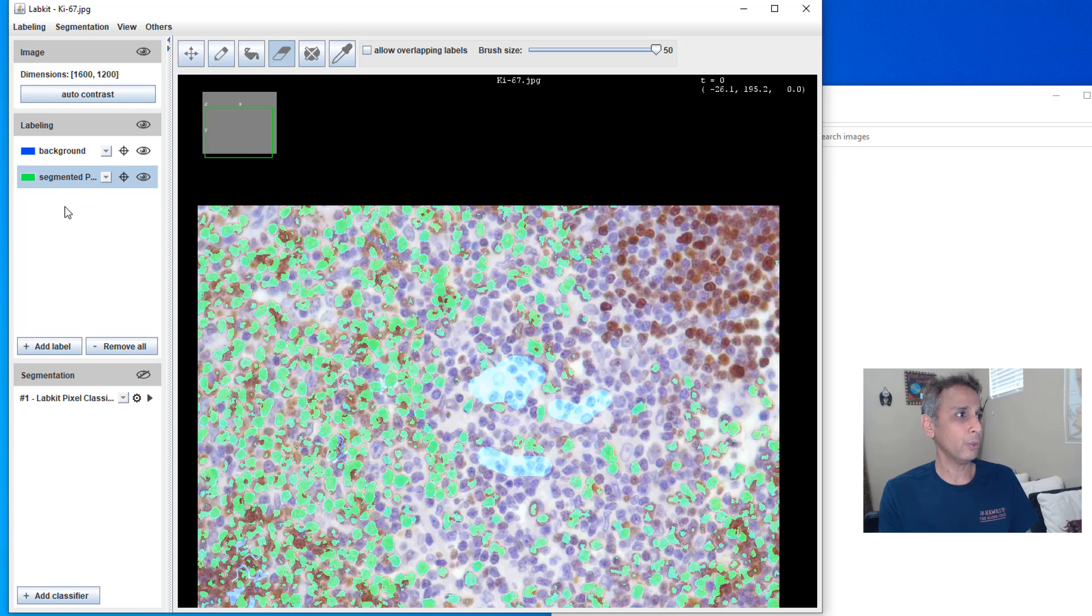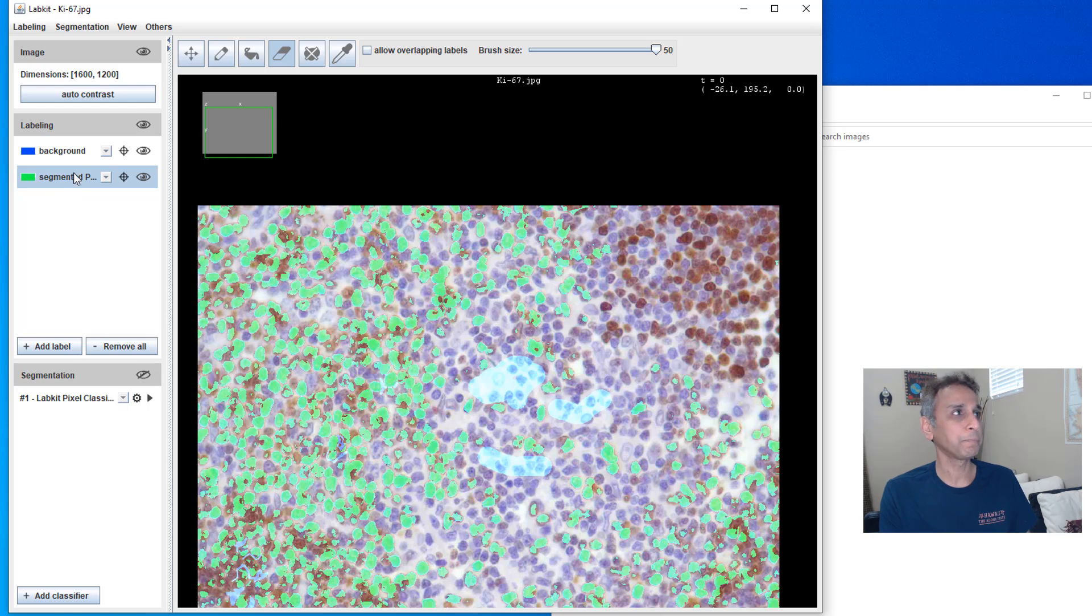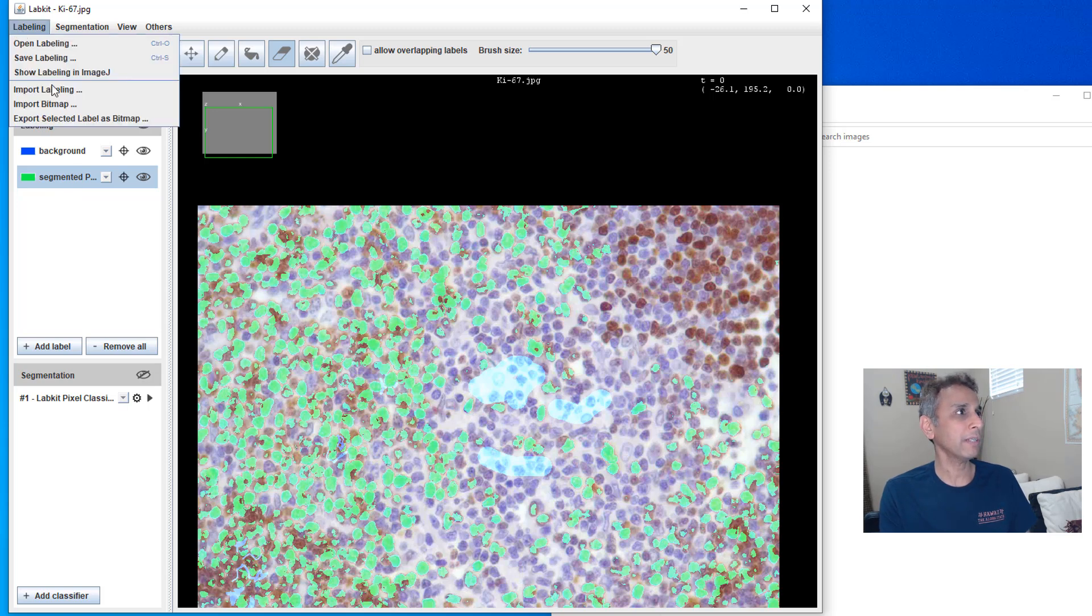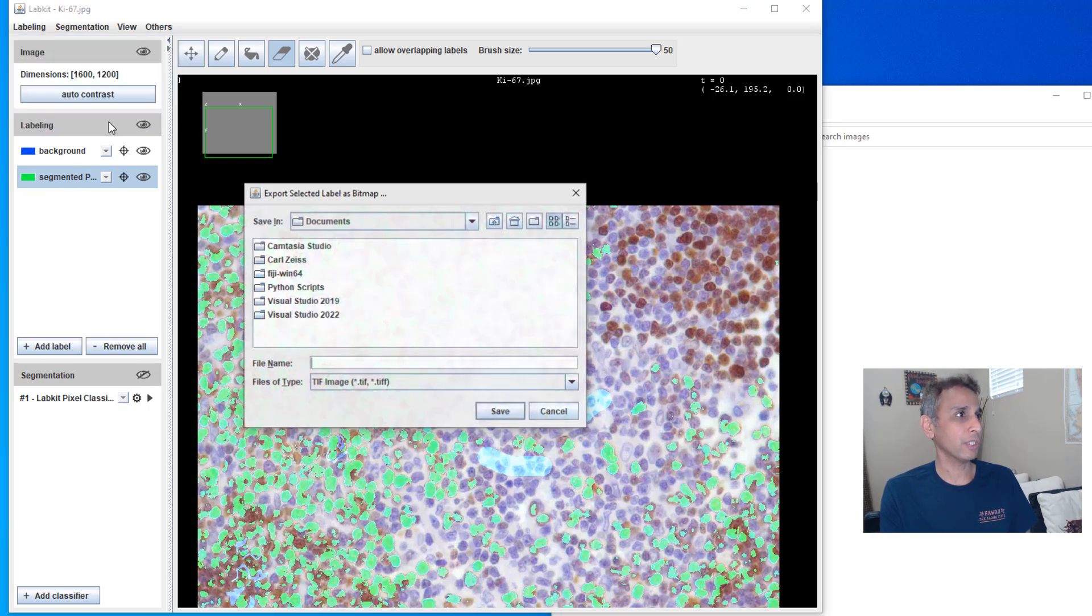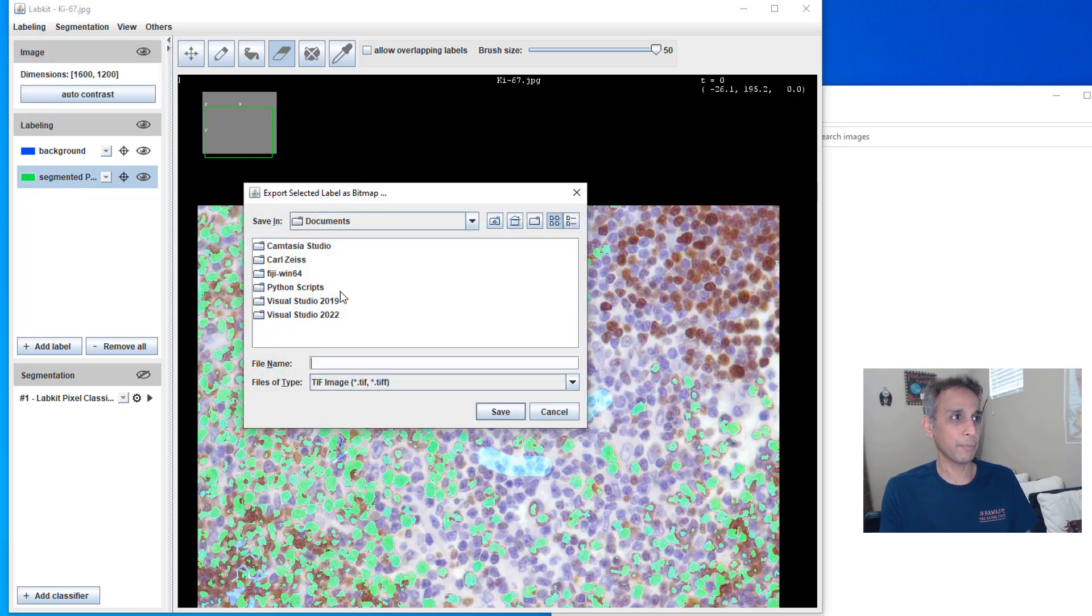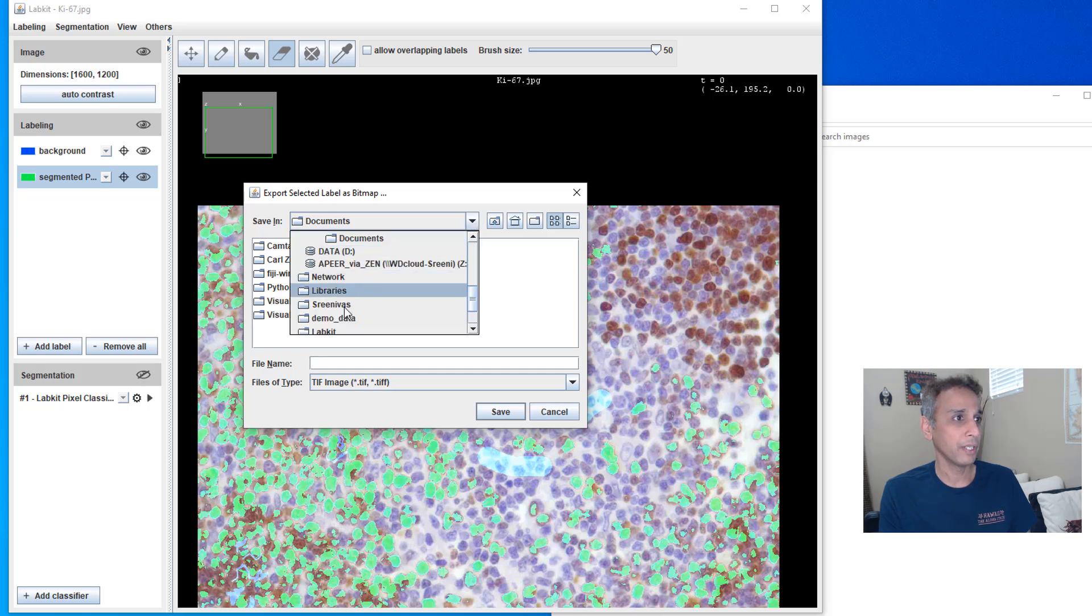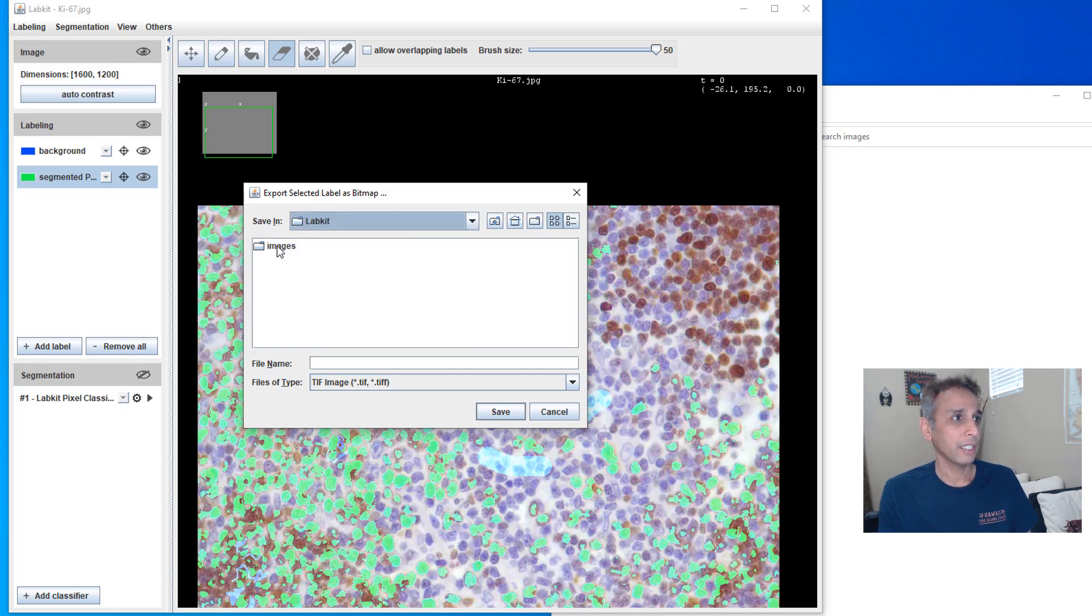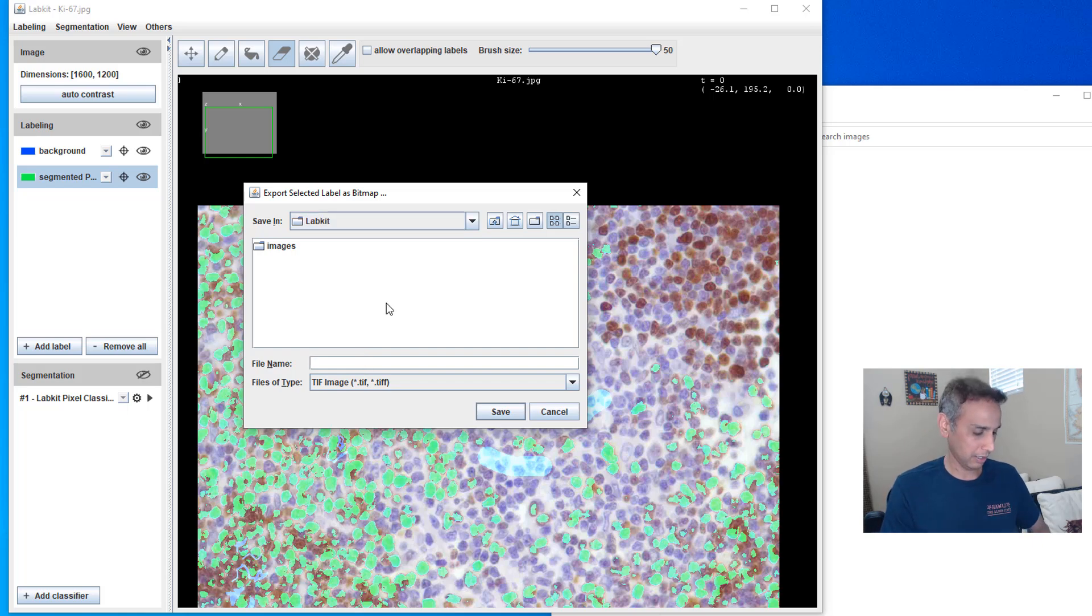So now let's say, okay, I'm good. Let's go ahead and export this. All I need to do is select whatever. So right in this case, I'm selecting my segmented labeling. Export selected label as bitmap.